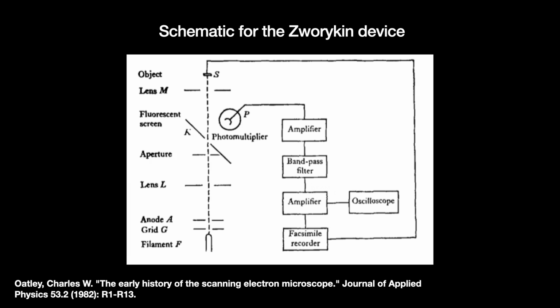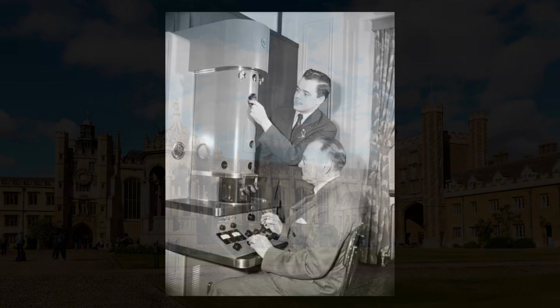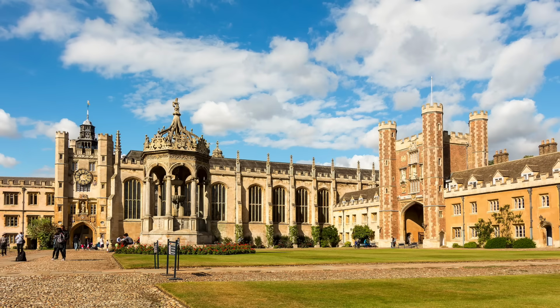This SEM did not image smaller features than existing TEMs. At the same time, the downsides were substantial. It was expensive. It took 10 minutes to make an image, and noise often clouded the images. RCA rightly decided to move on and focus on their transmission electron microscope products. There was little more work done on scanning electron microscopes for several years when Charles Oatley came along.